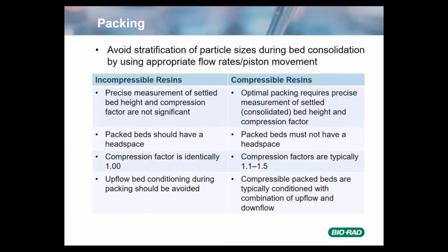Now for incompressible resins, in terms of the bed itself, you don't really need to know the precise height of the packed bed because there's not a compression factor, so there's no need to really measure it exactly to figure out exactly how much to compress afterwards. Packed beds should have a headspace because, again, these particles are fragile and you don't want to crush them by moving the top flow adapter into the bed itself. And if you want to think about compression factors, the compression factor for incompressible resins is exactly 1, meaning there is no compression. Because you're leaving a small headspace, you want to avoid upflow during bed conditioning because this will move the whole bed up and down, which is generally not a good thing.